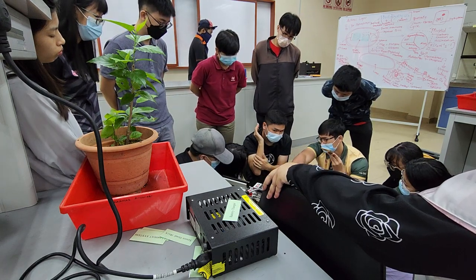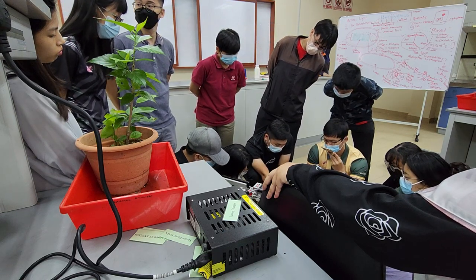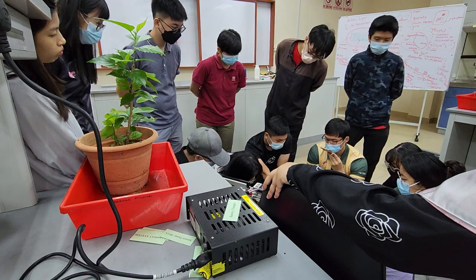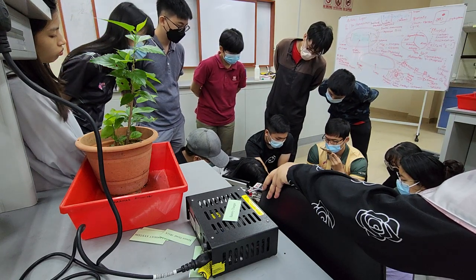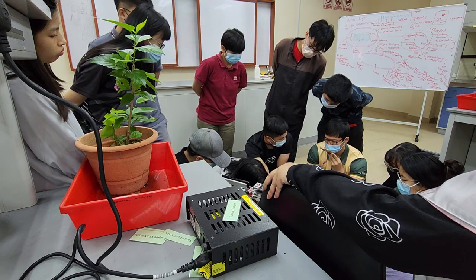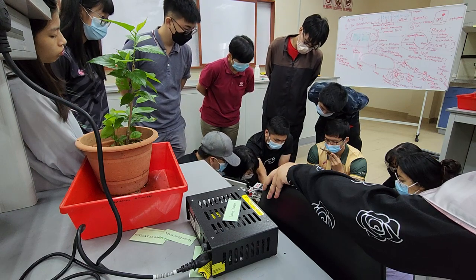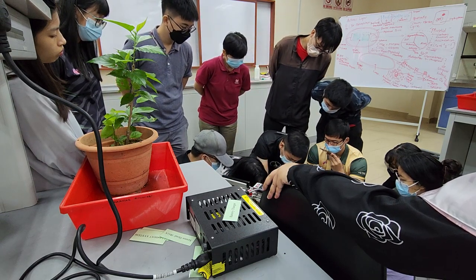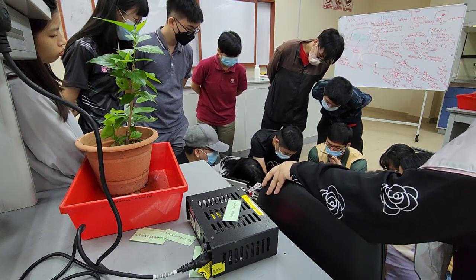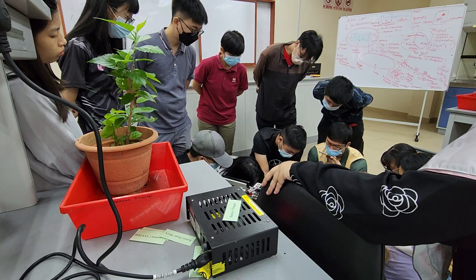Okay, so for the leaf fan, inside this thing, yeah, there is a fan here. So for the leaf fan, we'll make it fast. Okay, so for the flow, usually we'll set it 500 micromole per second. See whether it is 500 micromole. Connect balik battery tadi. Hot target 500.